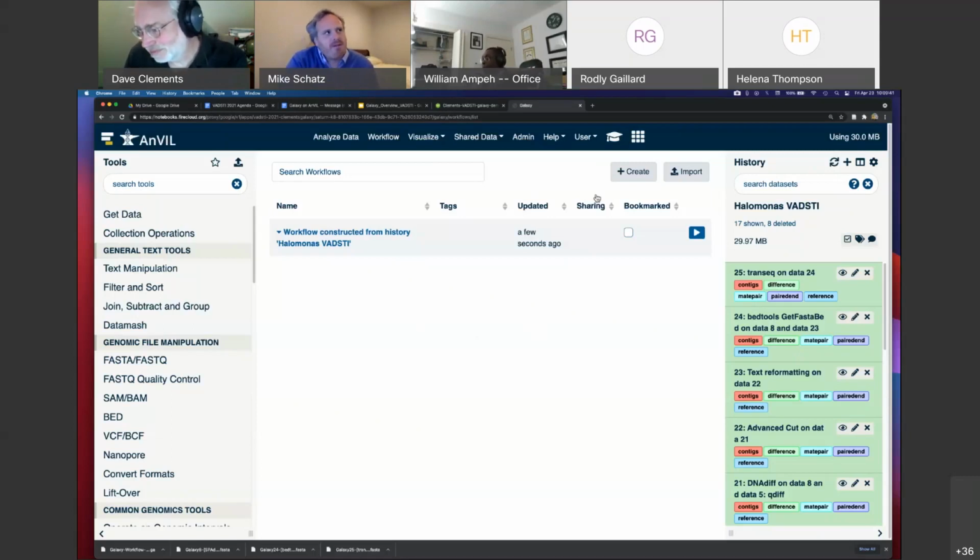I should say, everything we did today was real. We really do assemble and publish genomes with Spades. We really do align them with MUMmer to look for differences. We really do extract the differences. We really do translate the nucleotides back into proteins. The only kind of silly thing was having the secret message in English. Obviously, you wouldn't normally see that, but it just made it hopefully crystal clear that you knew that you had the right answer.